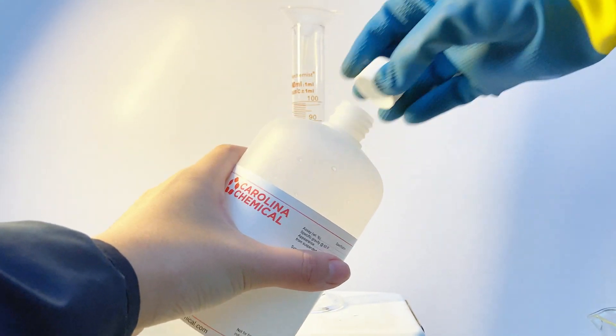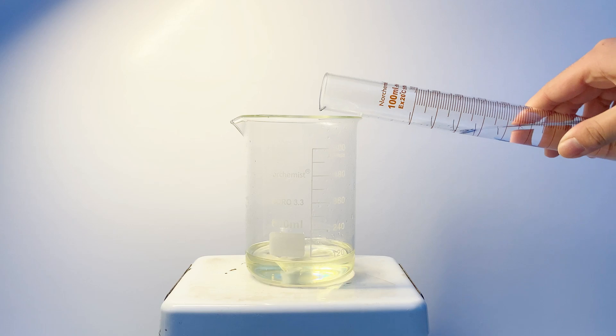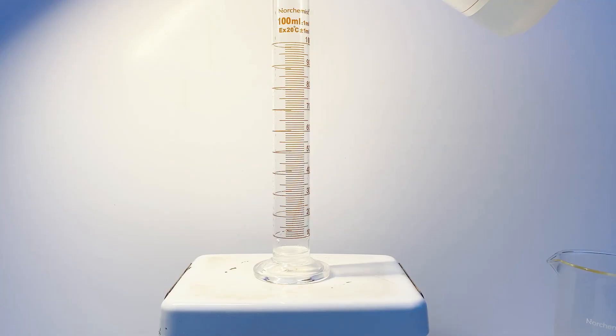According to the stoichiometric calculations, I went with about 47ml of 37% hydrochloric acid. I can then pour this into the solution and keep on stirring it. Now the last of the chemicals to add is hydrogen peroxide, and I can add it in slowly.